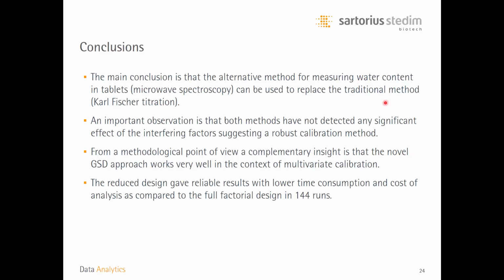The main conclusion from this study is that the alternative method for measuring water content in tablets, the microwave spectroscopy-based method, can be used to replace the traditional method based on Karl-Fischer titration. An important insight is that both methods have not detected any significant effect of the interfering factors, which strongly points to a very robust calibration model, a robust calibration situation.